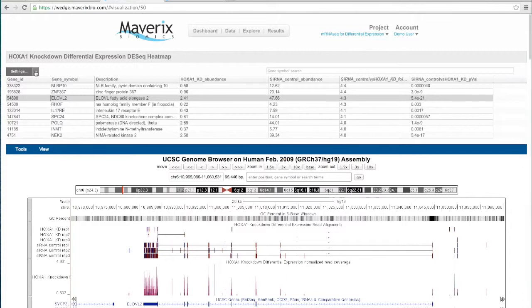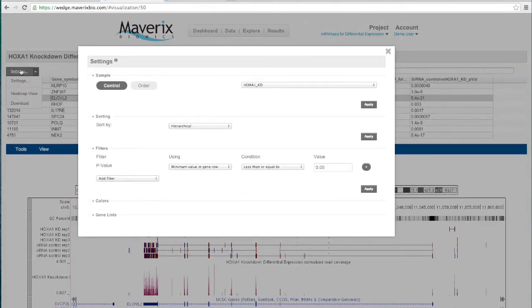And one final thing is that for either the heat map or the table view, if you click this downward arrow right next to the settings button, you can download that particular data set directly to a TSV file. So you have a nice tab delimited file with all of this data in it, and you can open that up in Excel and do additional analysis off the platform. So this is one of the great advantages of this type of view.